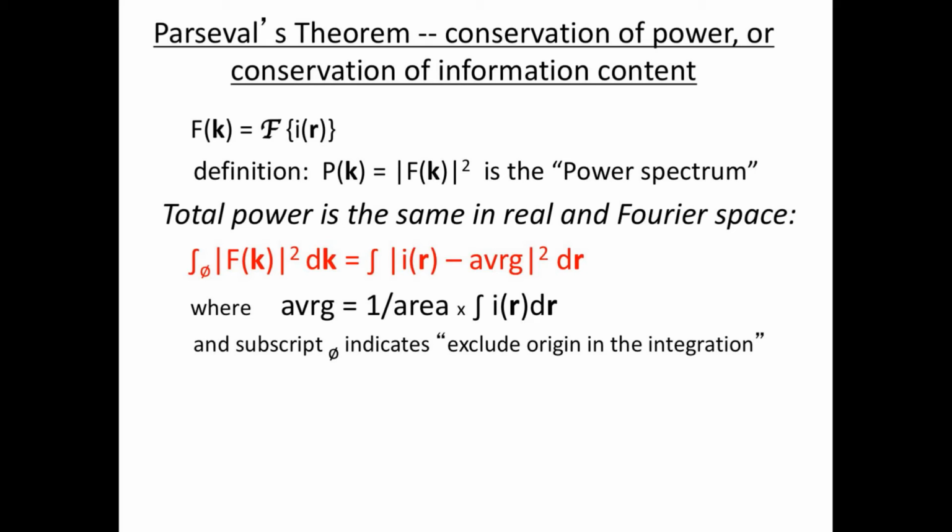Okay? So, in other words, you can go into Fourier space and determine exactly for any subdomain what the contribution of that subdomain is to the signal-to-noise ratio.